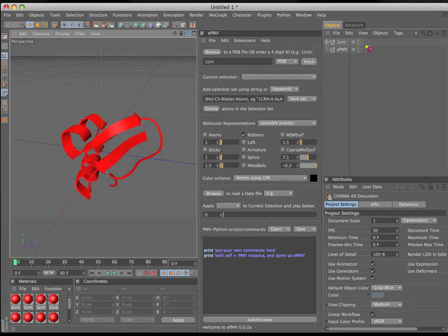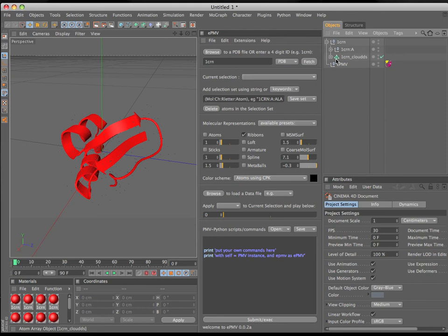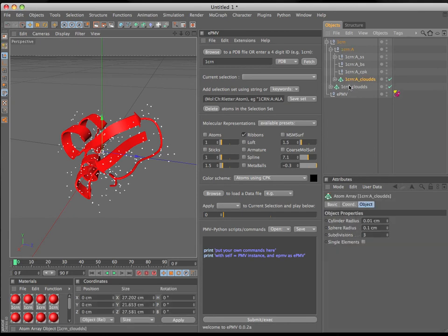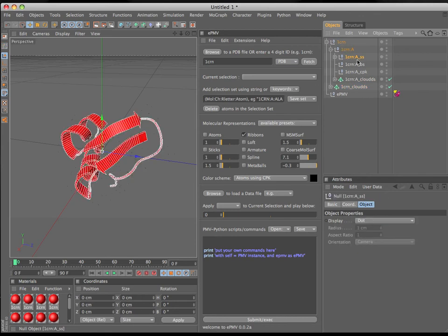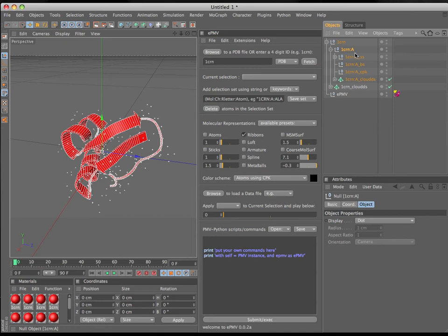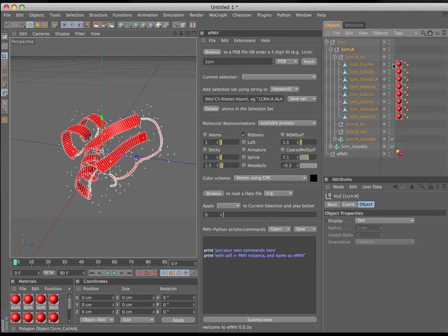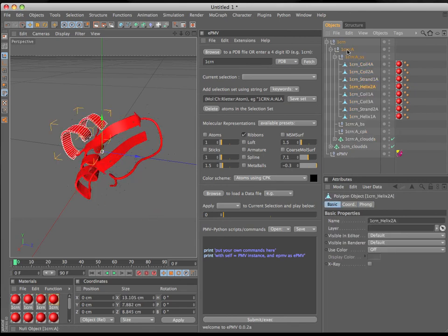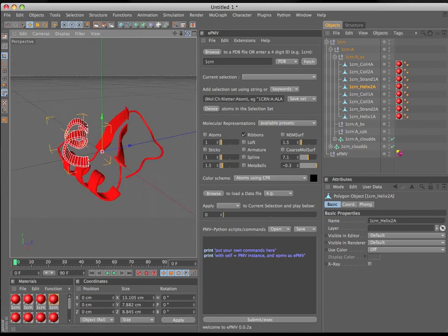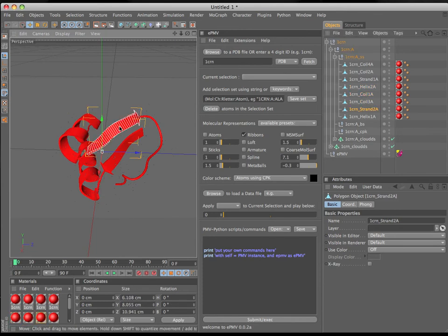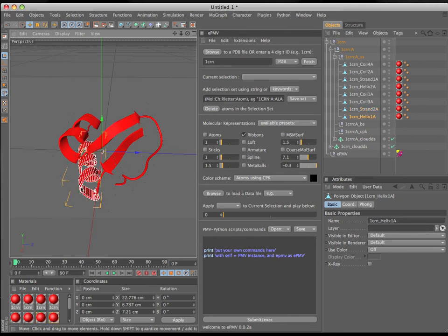We've downloaded it directly from the web, from within the graphic user interface of Cinema 4D and from within the EPMV window. That loaded it into our system, and it generated a hierarchical representation over here in the Objects Manager. In here, we can see what's called a point cloud, which represents the positions of all the atoms. We've already generated a secondary structure. In this hierarchy, we have the entire molecule, and the chains — in this case 1CRN only has a single chain, so there's only an A here. I can click through the elements of the secondary structure and see them highlighted both in the Object Manager and in the Viewport. I can also click in the Viewport, and that changes which object is highlighted in the Object Manager.